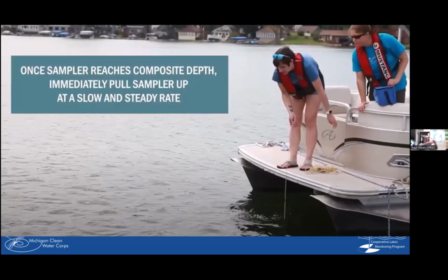Just a steady hand-over-hand action at a steady rate. The reason a steady rate is important is because we care about the water at the bottom, and we care about the water in the middle, and we care about the water at the top, and we want to make sure all of that water is going through our stopper and getting in the sample.